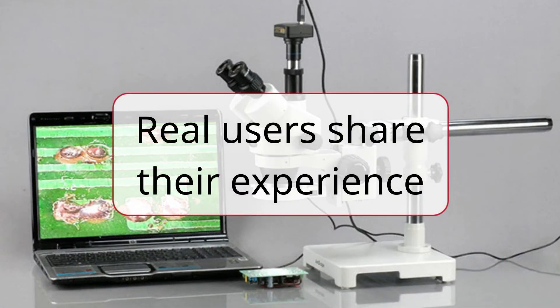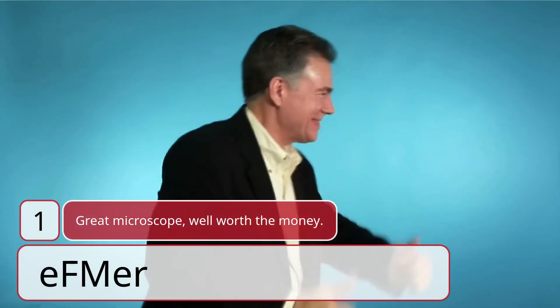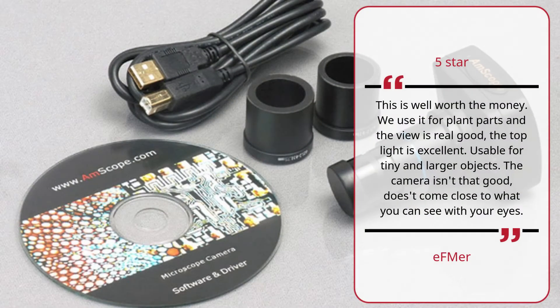Real users share their experience. Number 1: Great microscope, well worth the money — Ephmer, 5 stars. This is well worth the money. We use it for plant parts and the view is really good; the top light is excellent. Usable for tiny and larger objects. The camera isn't that good — doesn't come close to what you can see with your eyes.